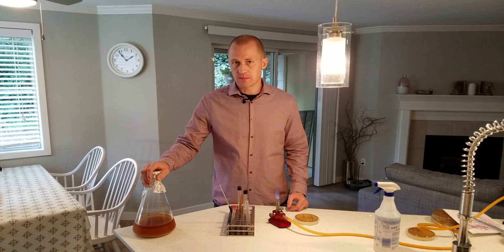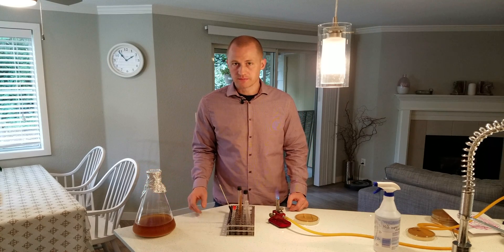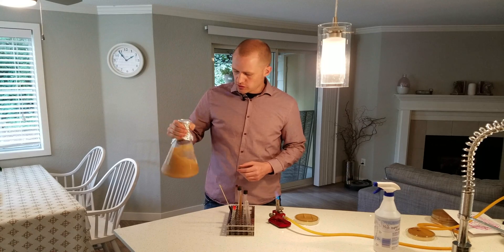We're going to be using this sample, so we'll be doing it slightly differently. Since the yeast has settled to the bottom, I'm going to stir it up just to get it into solution.